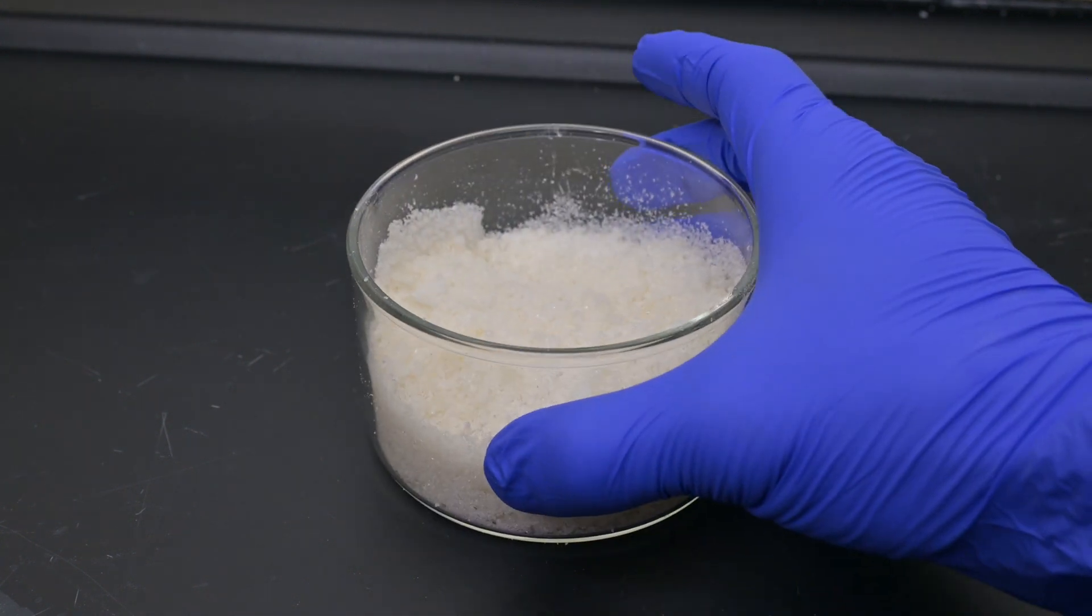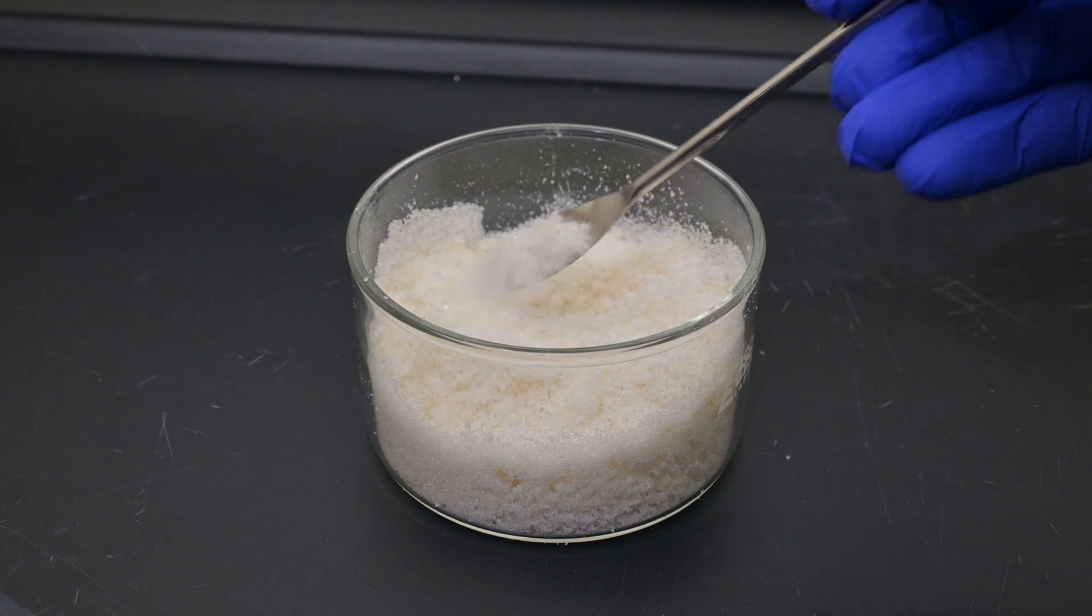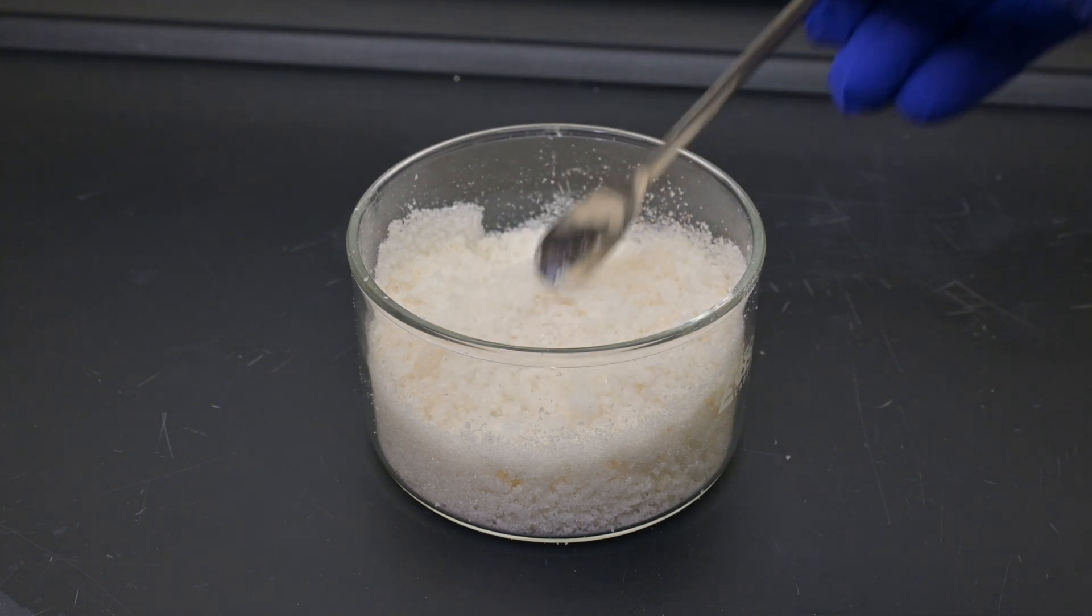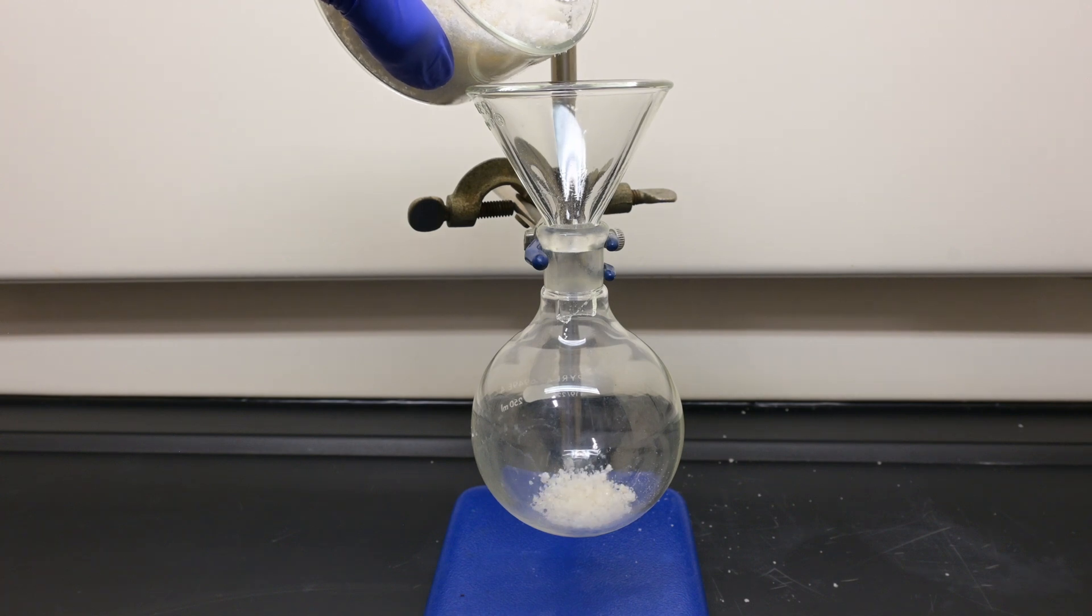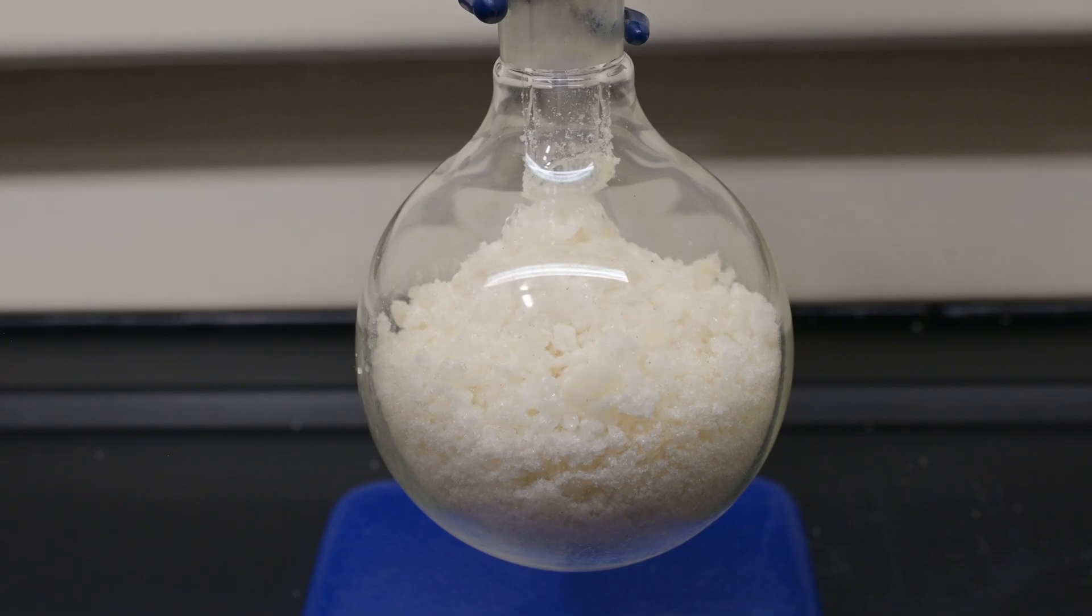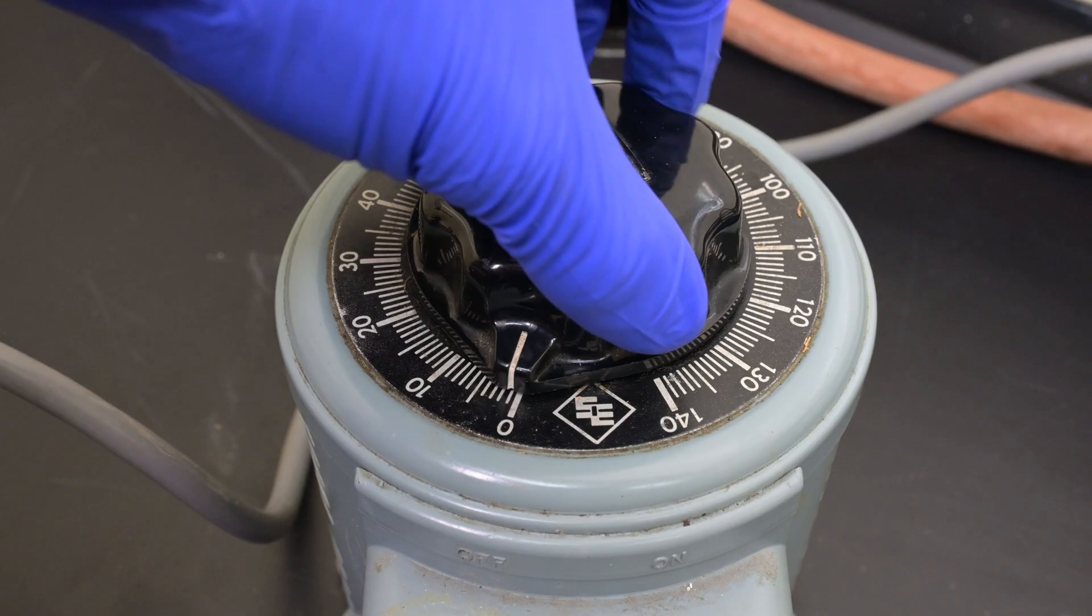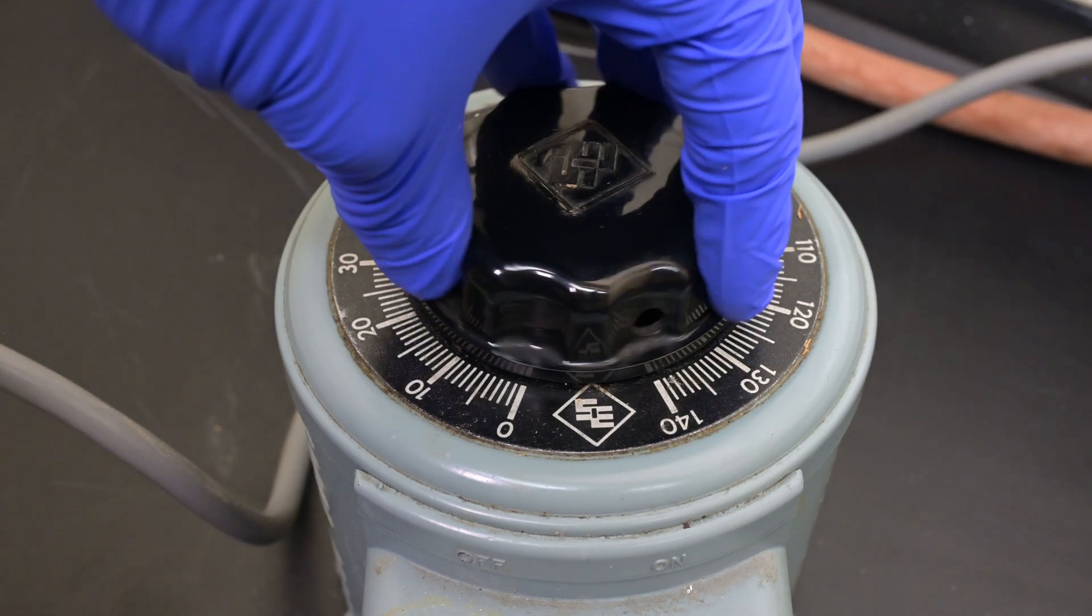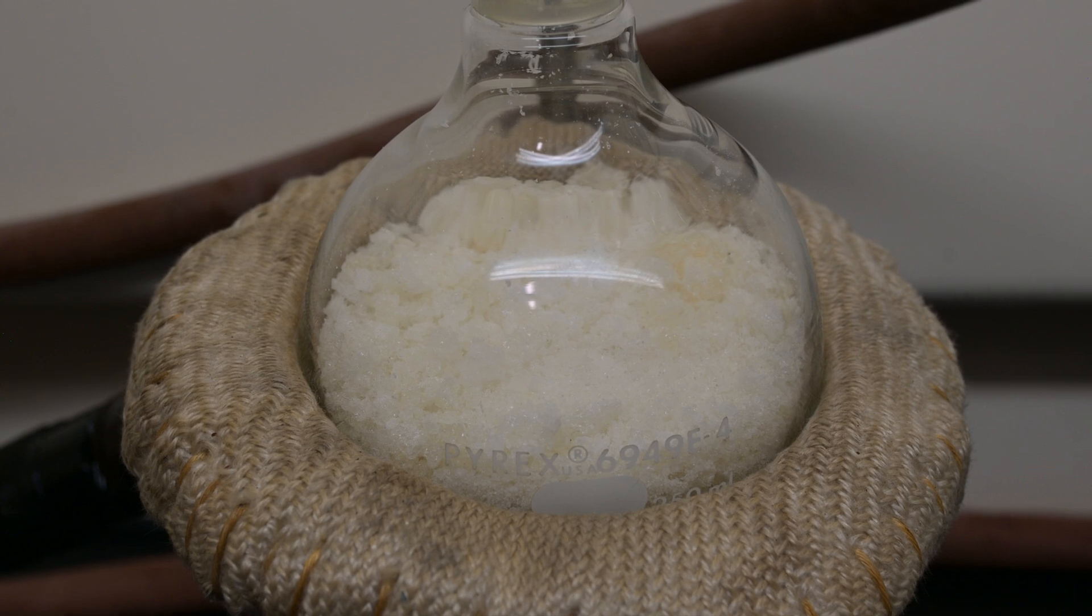The method that I will use today is known as destructive distillation. We can crack the organic compounds bonds with a high enough heat. The polystyrene is then transferred into a flask, preferably one that you don't care much about. Next, a simple distillation setup is put together along with a heating mantle. The reaction flask is ramped up to 450 to 500 degrees Celsius. High temperatures are needed for this reaction to take place.